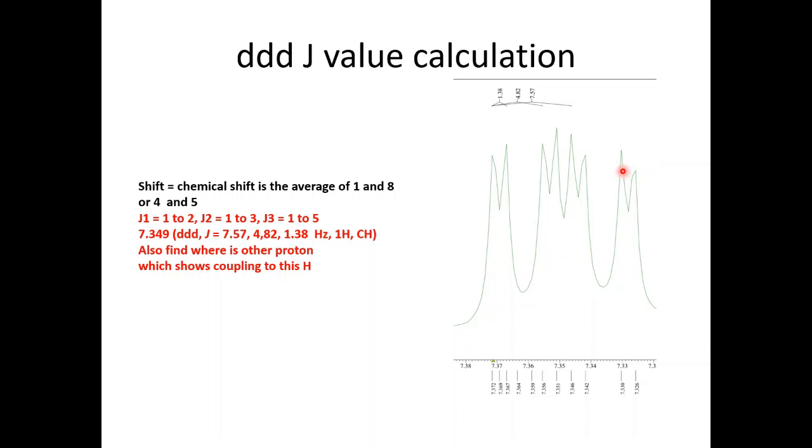1.4 to the other proton. Click on this one, click on this. If you get 1.4 here, then report that J value. Sometimes it came from experimental error 1.38. Also take care about the other J value.